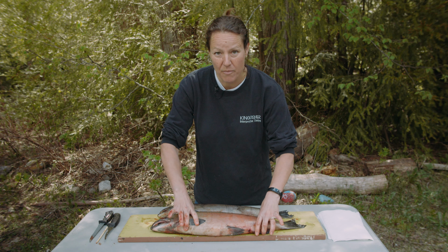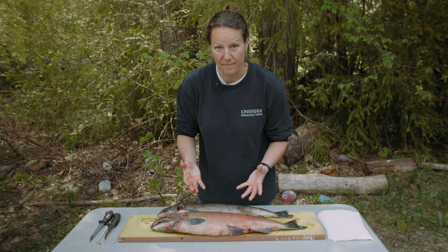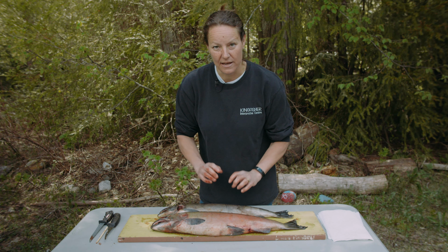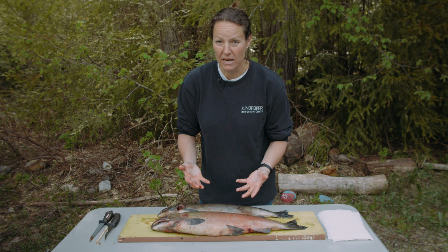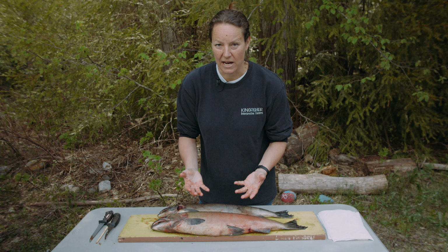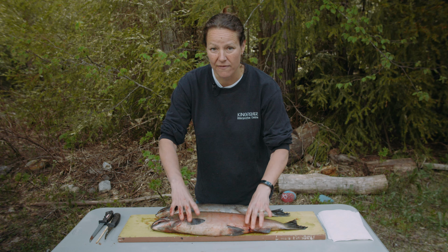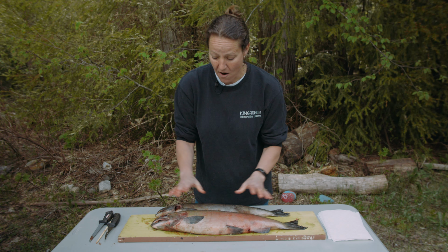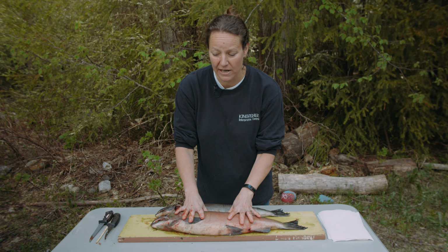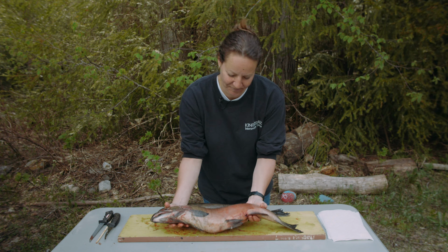Excellent. Now, boys and girls, we're going to look inside the girl fish today. What do you think we're going to find inside? Are we going to find eggs or are we going to find milt? Now, milt is fertilizer. So the girl fish is going to hold the eggs, and the boy fish is going to be who holds the milt. All right, now I'm just going to remove this boy fish. We're just going to put him over here for a minute. So I'll be right back.